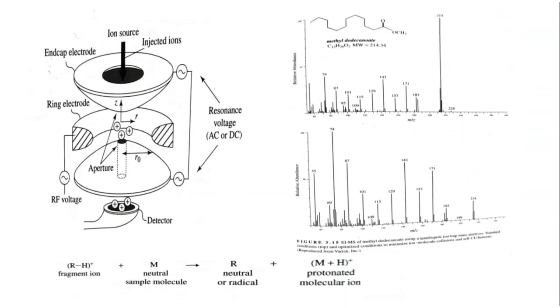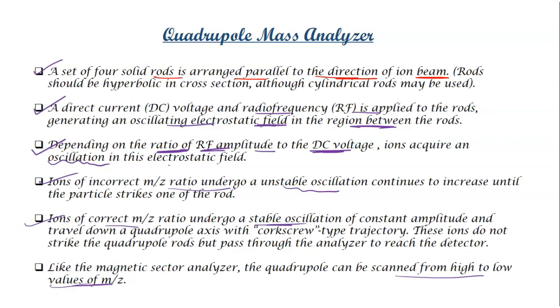That is another thing. Over here you can see another diagram. But before talking about that particular diagram, I would like to add a few points related to the quadrupole mass analyzer. This quadrupole mass spectrometer is actually a low resolution instrument. Let me write it for you: these are low resolution instruments, having resolution at around 3000.